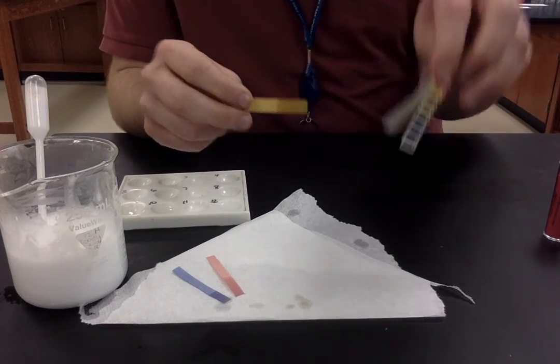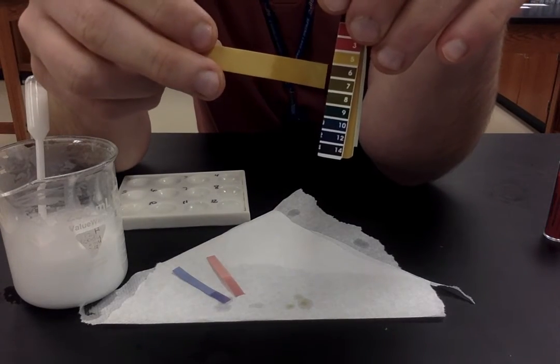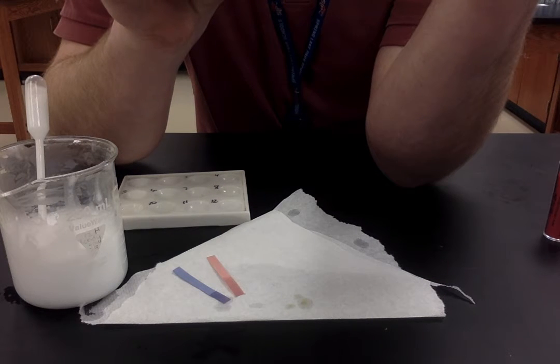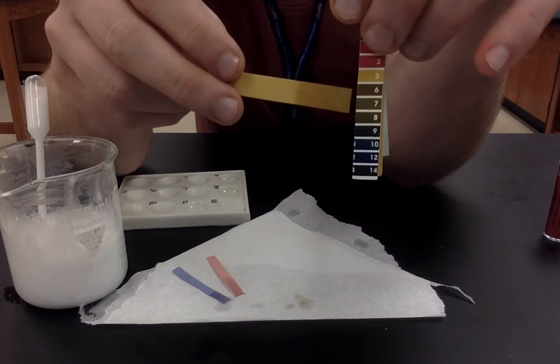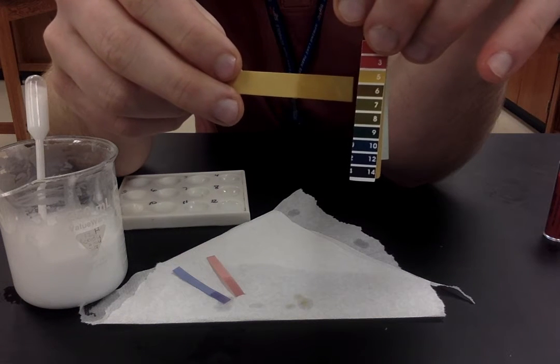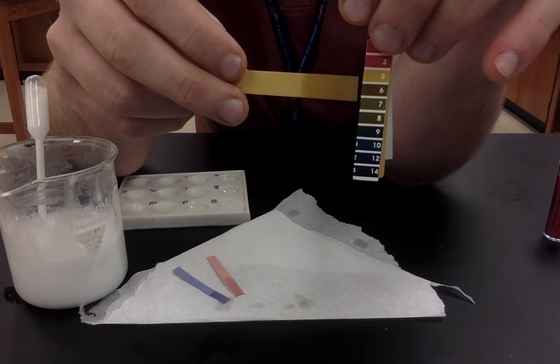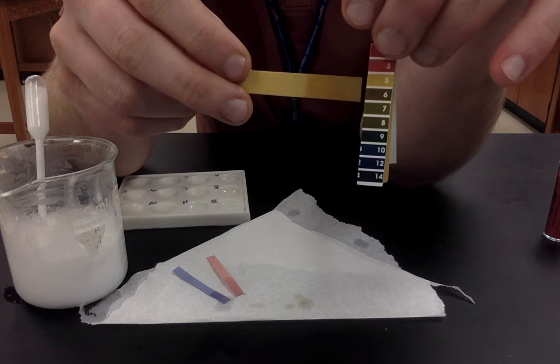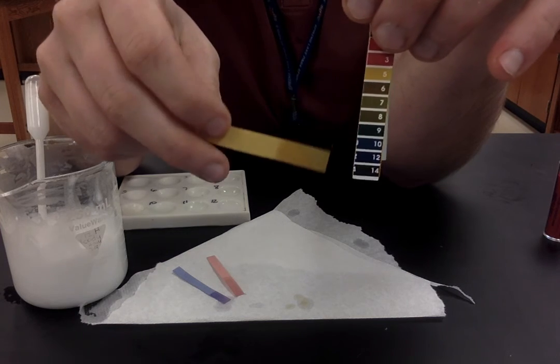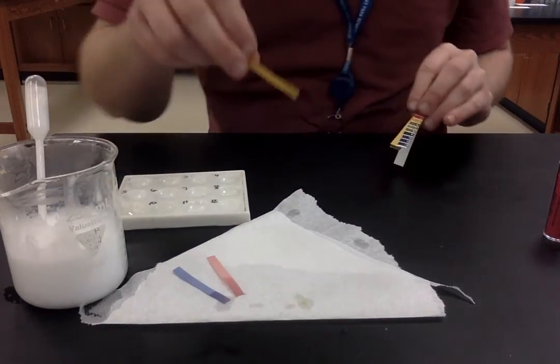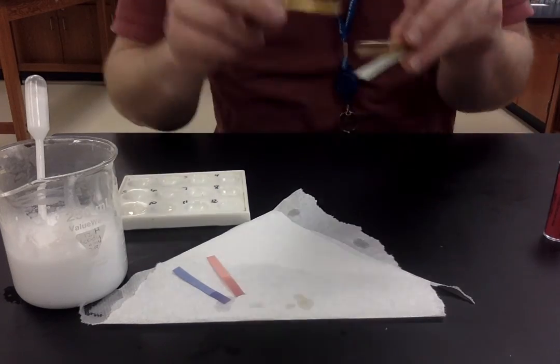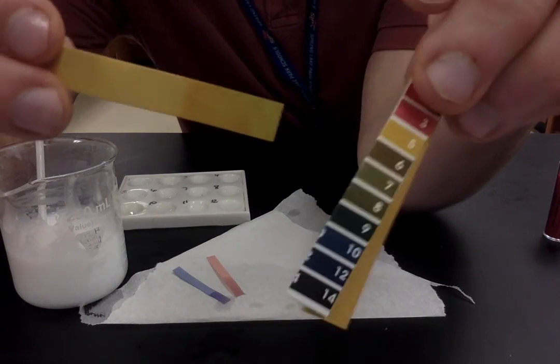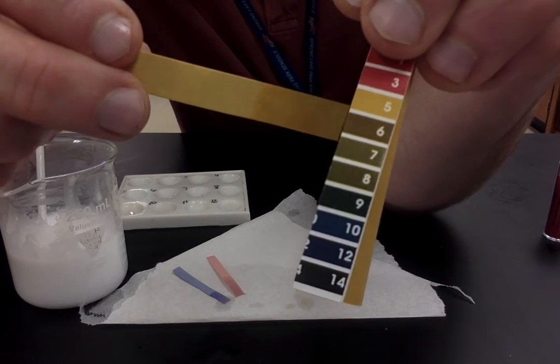All right, so next up we have our pH paper here. You can kind of see it falls sort of right around a six. Actually, looks like that might be the closest, so we'll say that the hand lotion is a six. Go ahead and write that down, and it's like a brownish color.